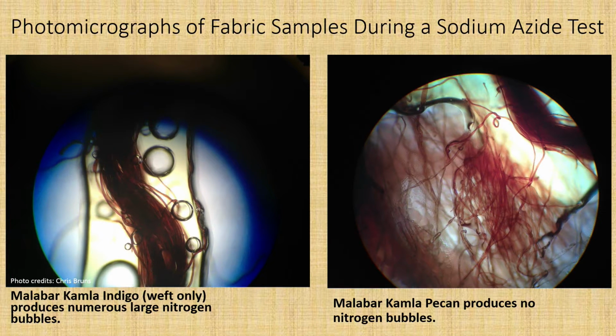If bubbles form within 2 minutes, the sample can be deemed unsafe for use with artwork. As with the Oddy test, the sodium azide test evaluates materials and places them into one of 3 groups: acceptable for permanent use, acceptable for temporary use, not in contact with artwork, and unacceptable for use with artwork. The distinction is found in how vigorous a reaction occurs.